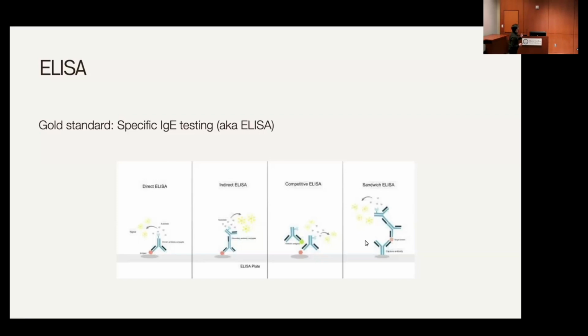It's also really important to note that it's always the last step where we're introducing this, because if we introduce it in an earlier step, it's really easy for it to get muddled with all the other antibodies and potentially even antigens that are present in the serum or urine. So we want to give that enzyme-linked antibody as best a chance as possible to interact with the substrate, so we have it as the very last step, so it's on the surface, and there's more surface area for it to interact again with the substrate, if you will.